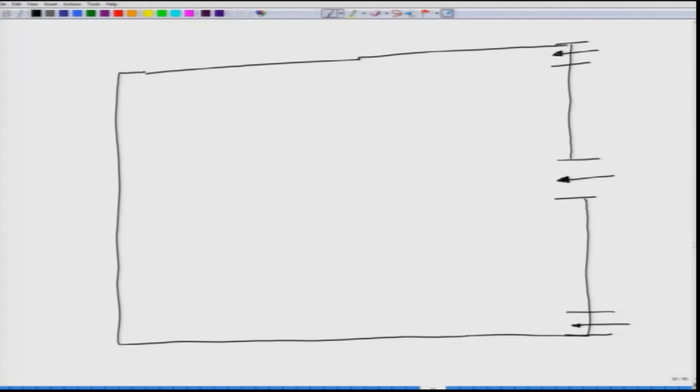So, what we talked about is A, B, C, D, the 4 corners of a room, and we talked about either this corner, where you will have I1, or this corner, I2, where you will possibly be placing the incubators, and you will have a countertop something like this.